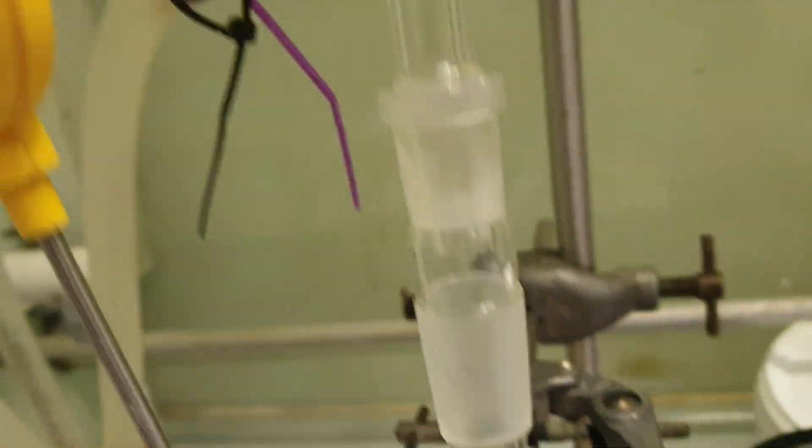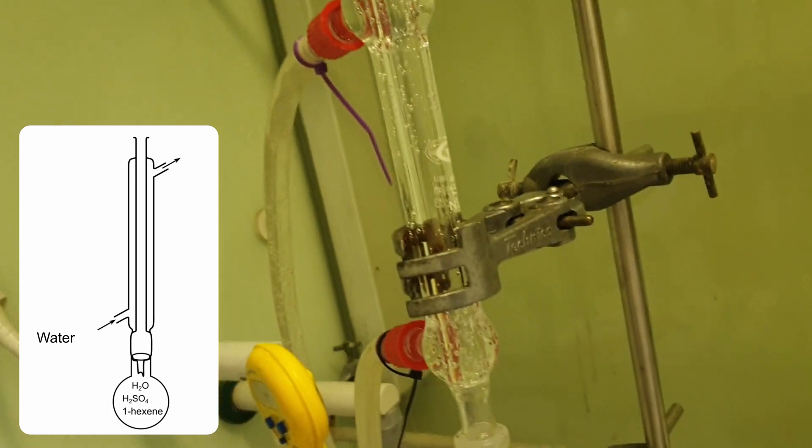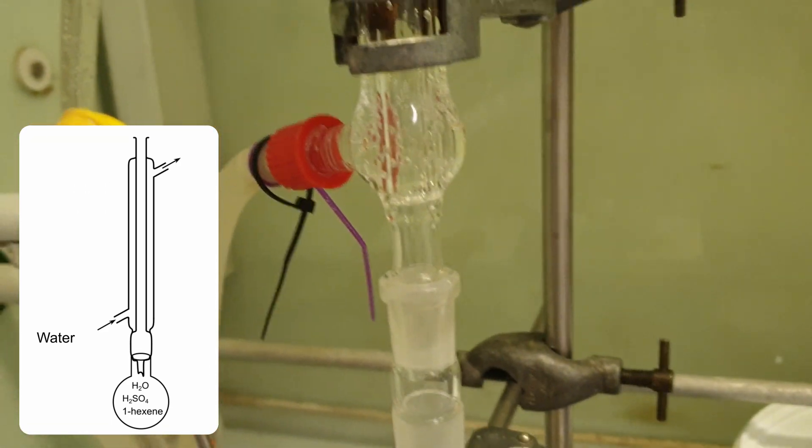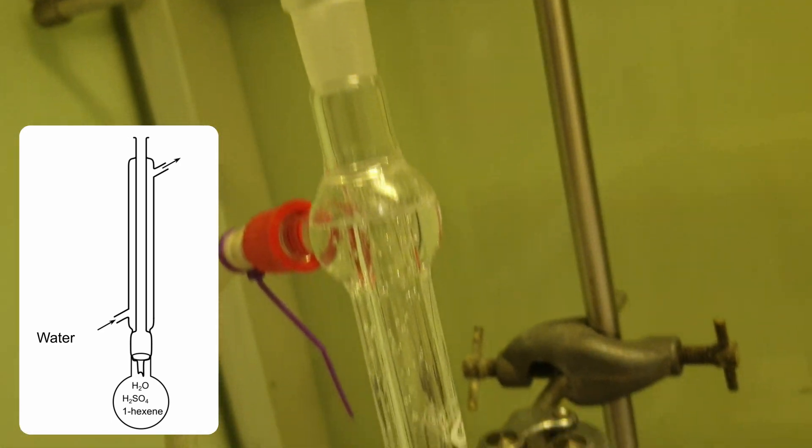Here I'm showing off my reaction setup, it's just a reflux column. This allows you to boil the reaction mixture without losing all the solvent because it gets condensed by the water jacket back into the reaction vessel.